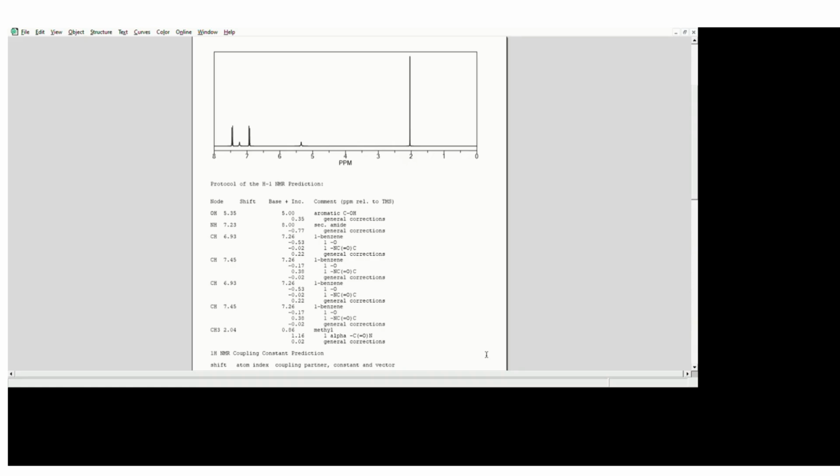Just write down the reference group. Like if it is CH3, it corresponds to aliphatic, or it is aromatic or the bonded proton. Along with that, you're supposed to mention the coupling constant in detail. That is very easy.